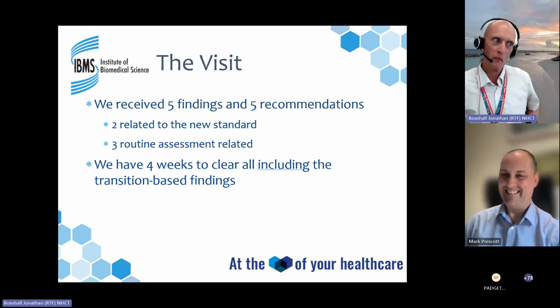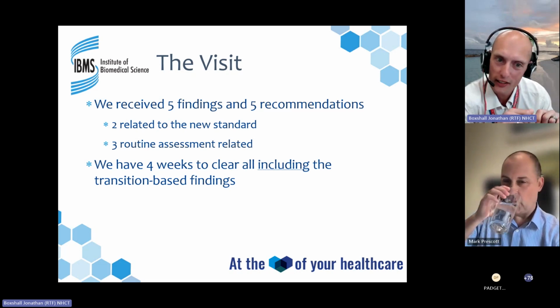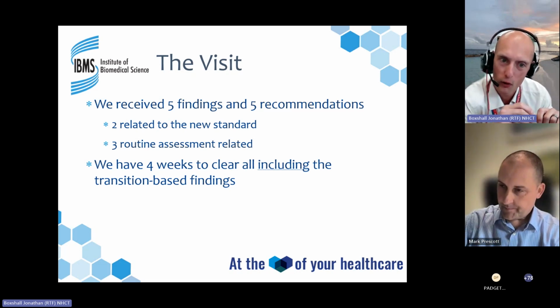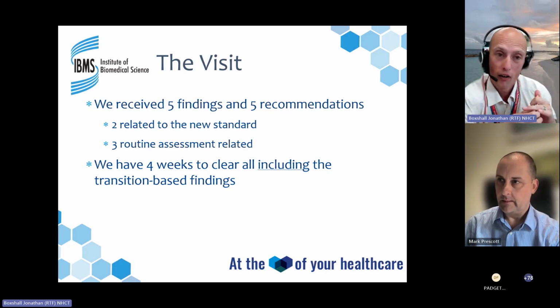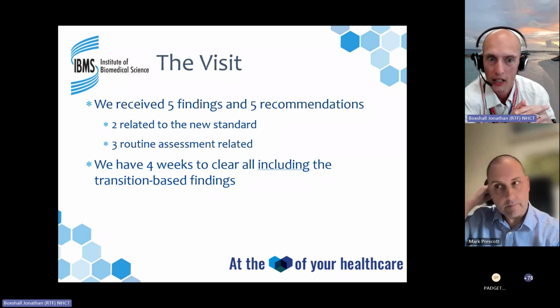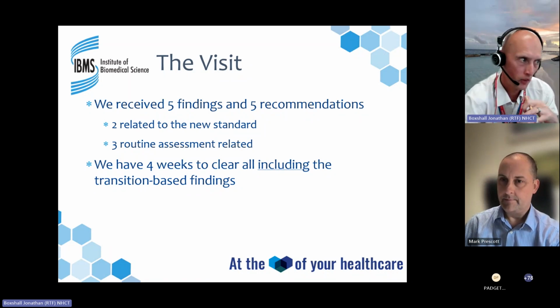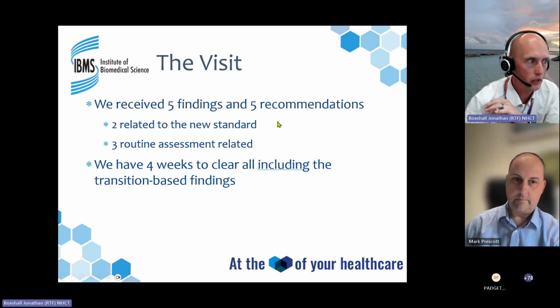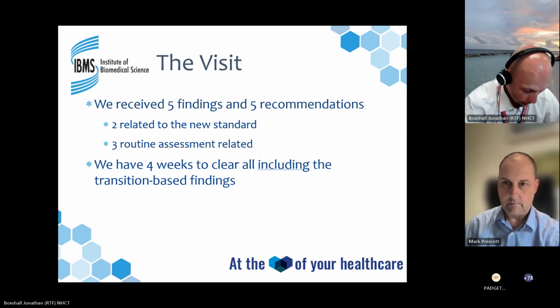So I'm pretty happy with that. And I'd like to think that some of that is probably due to the fact that I play both sides of the field, so I get to see what I need to look at and focus on more. That's effectively why I do UKAS assessing, to try and make it easier for my department. I get the experience to do the assessing, see what's being looked at, see what the key issues are, and I can come back and go, we need to focus on X, Y, and Z. So we have 2 related to the new standard as part of transition, and 3 which is just part of the routine.